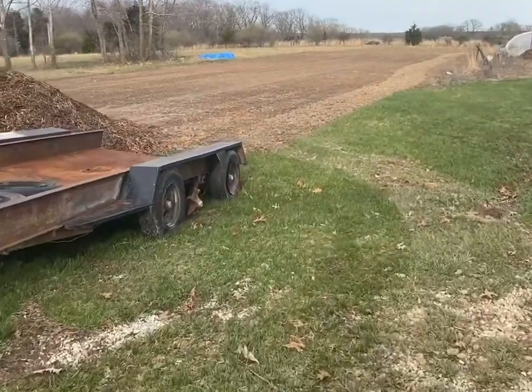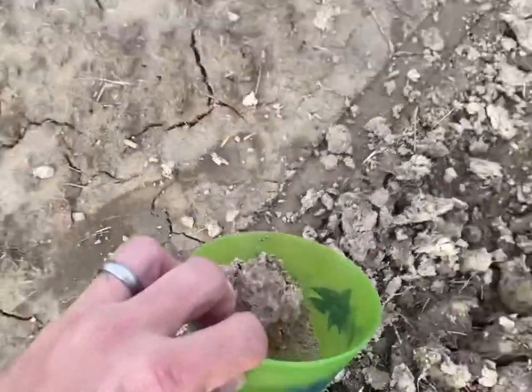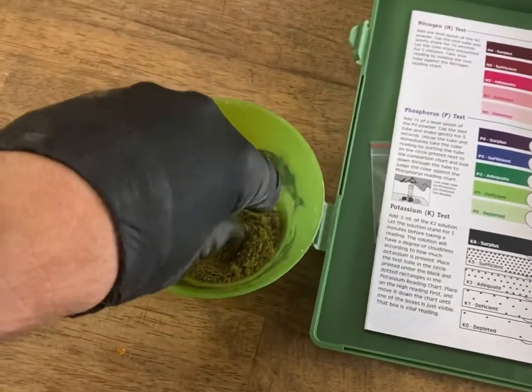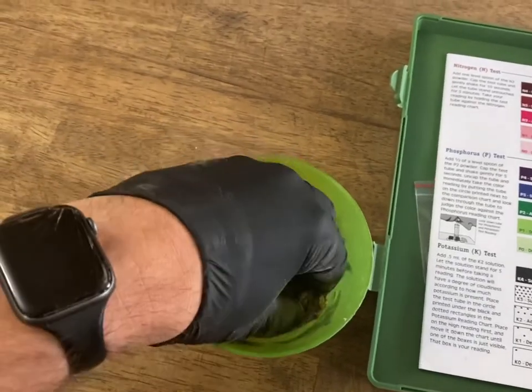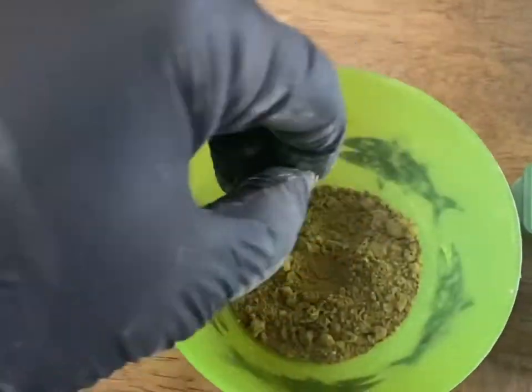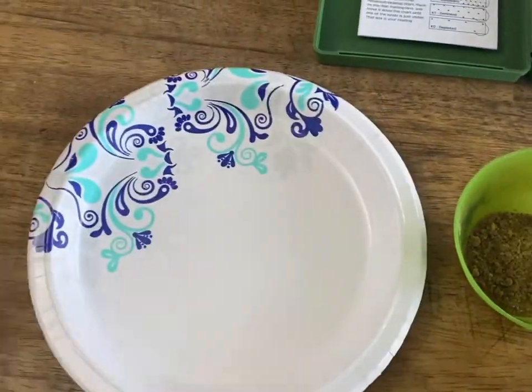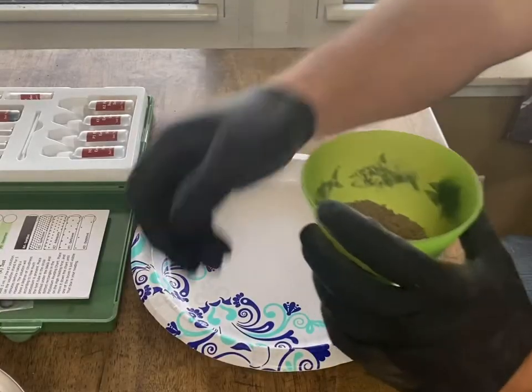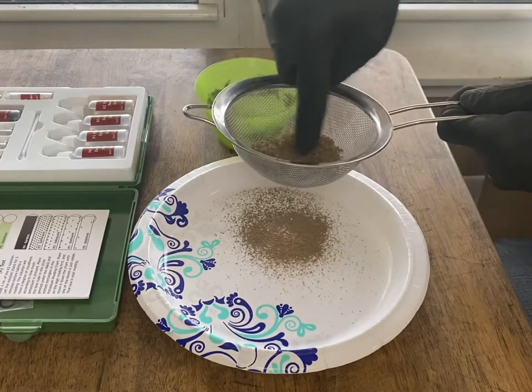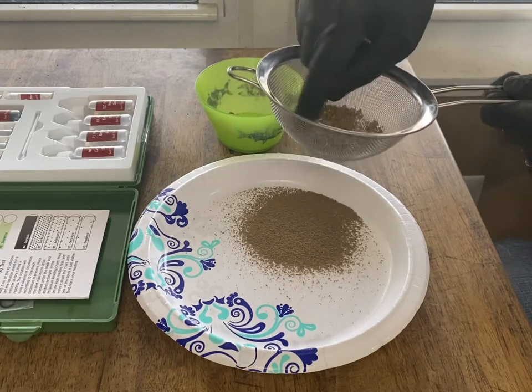I've got to head over to the garden and collect some soil. This dirt clump right here ought to do it. I put some rubber gloves on and my fingers are kind of dirty because I've just been squishing and crumbling this dirt up trying to make it fine — nice and fine, no clumps. Maybe I'll put it through some kind of a strainer.